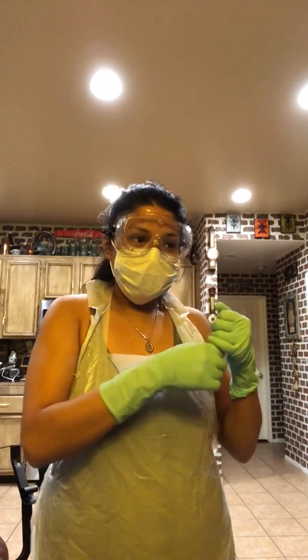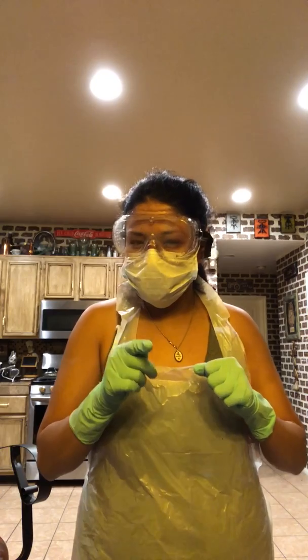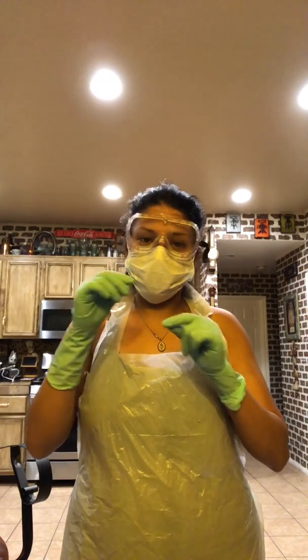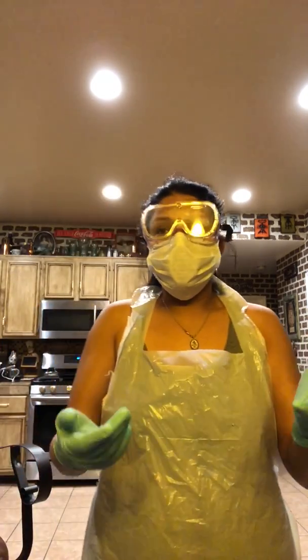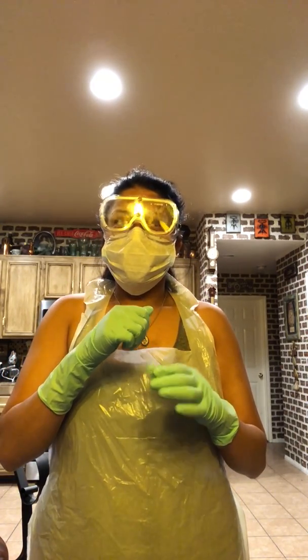Then I grabbed the 6 empty test tubes that came in our lab kit, and I poured exactly 2.4 milliliters of water into these test tubes, because I couldn't get 2.5. I labeled the 6 of them 10^-1, 10^-2, 10^-3, 10^-4, and so on to 10^-6.